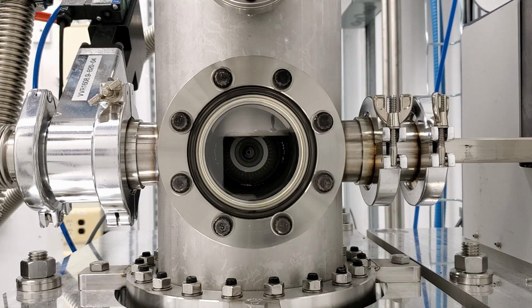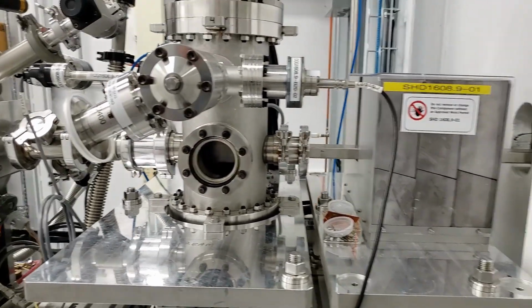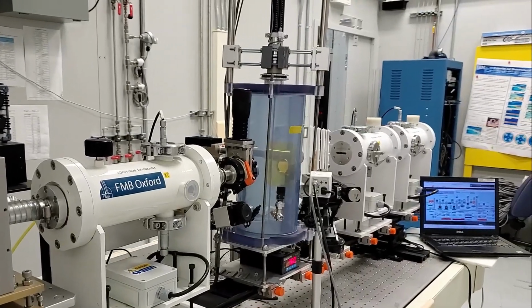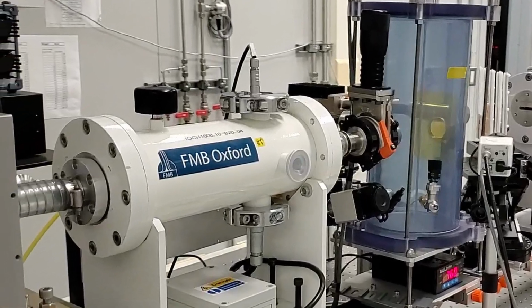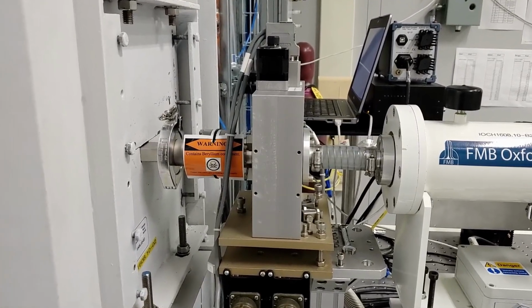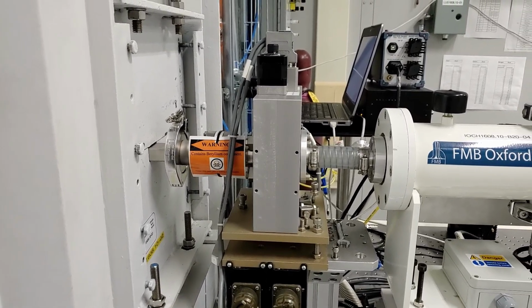The last component in the PoE is the safety shutter, which is a large tungsten block that can be dropped into the beam path to prevent any X-rays from entering the SOE, making it safe to work in that hutch. The SOE contains a variety of equipment and instrumentation that can be used to analyze samples in several different ways using the light from the synchrotron. Just inside the hutch is a second set of 4 jaws that can be used to crop the beam down to the size required for a particular measurement.